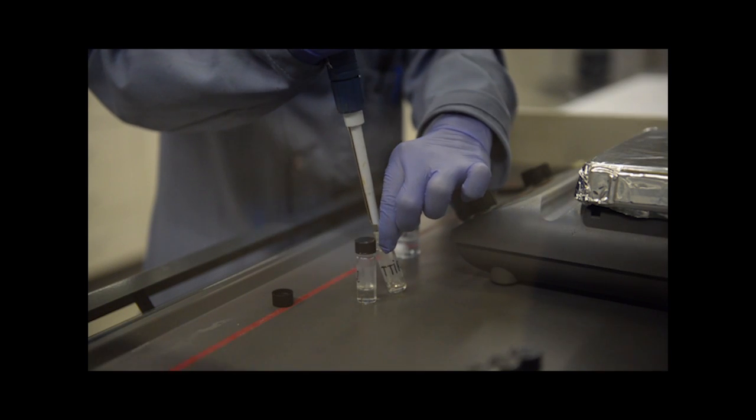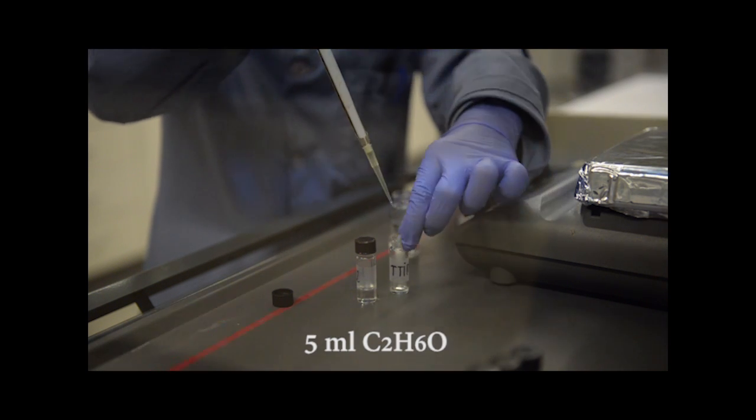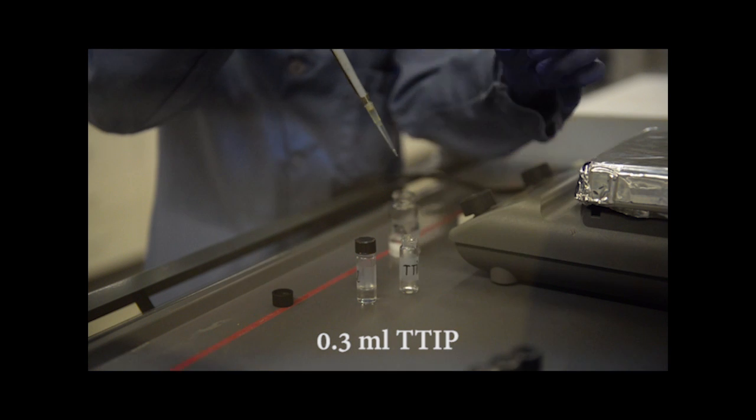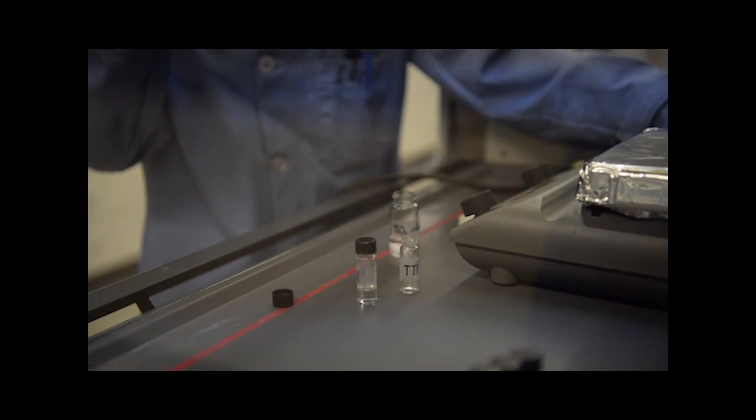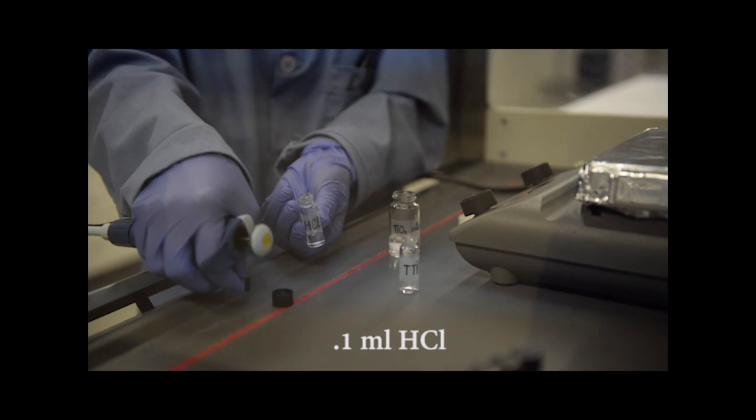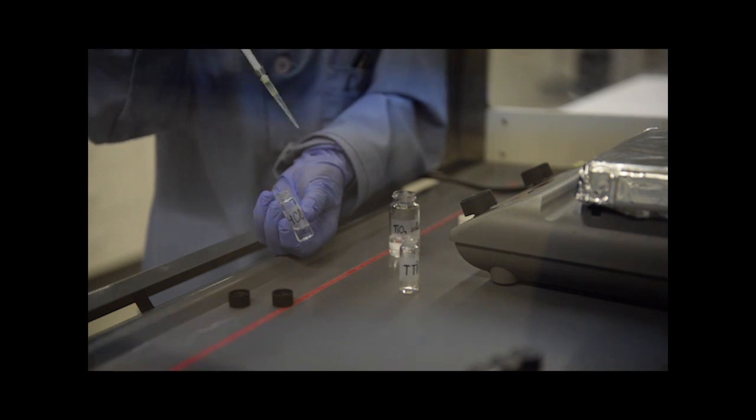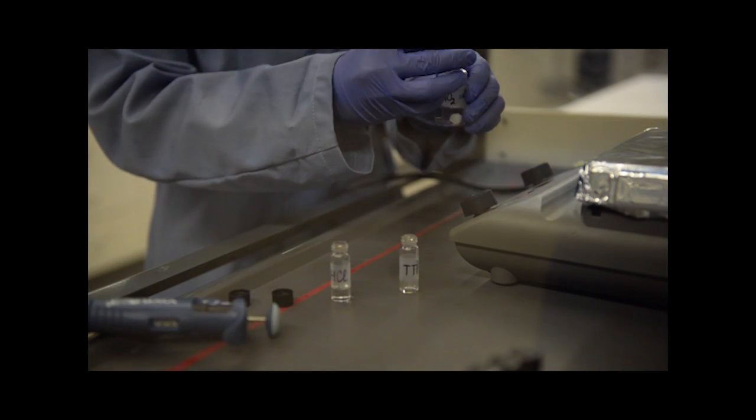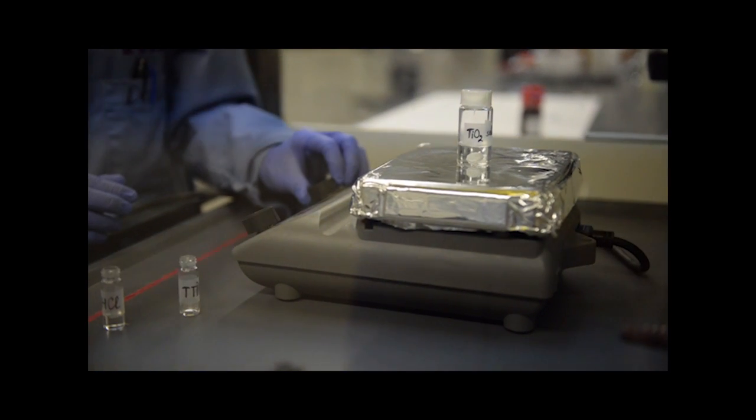To prepare the titanium solution, we use 5 milliliters of ethanol, we add 3 milliliters of titanium isopropoxide, and 0.1 milliliters of hydrochloric acid. After adding the three together, we let the solution stir at room temperature for about 10 minutes.